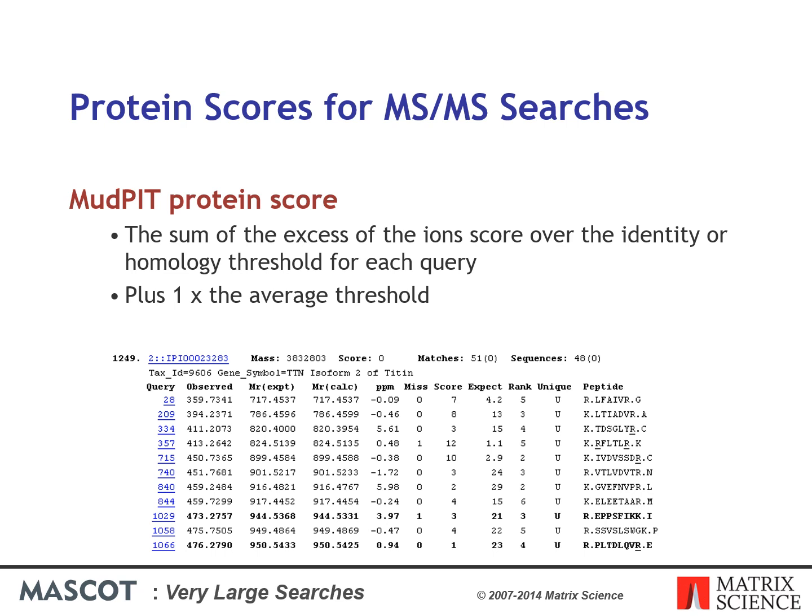So even though a large protein like titin may pick up several random matches, with Mudpit scoring, the protein score is 0, so you don't see it listed in the report unless you specify a huge number of protein hits, as was done here to capture this screenshot.